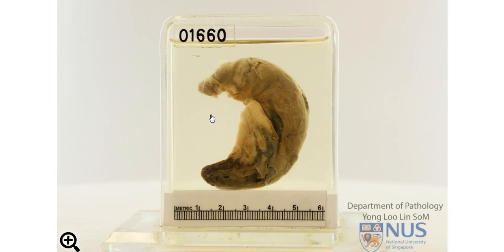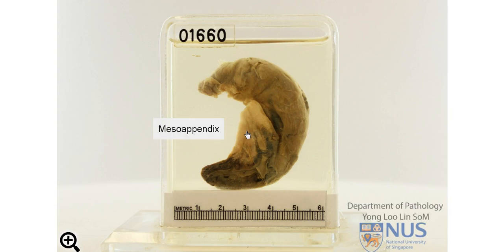Hello, here we're looking at an appendix. This is the proximal end which has been tied off, and here is the tip of the appendix. Just to orientate you a little bit, we're looking at the serosal surface here. This is the mesoappendicial fat, and at the tip region the appendix has been bisected longitudinally.